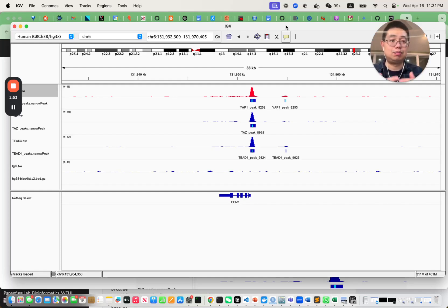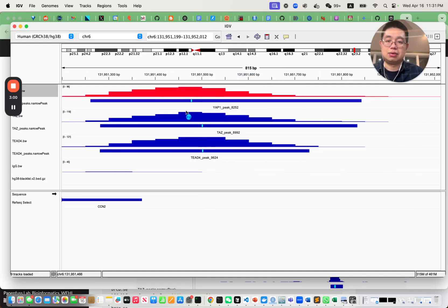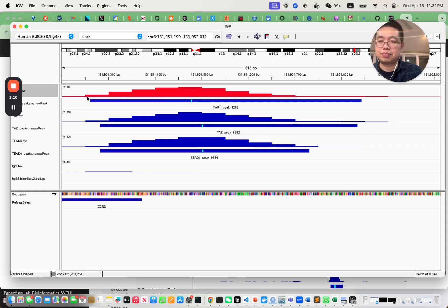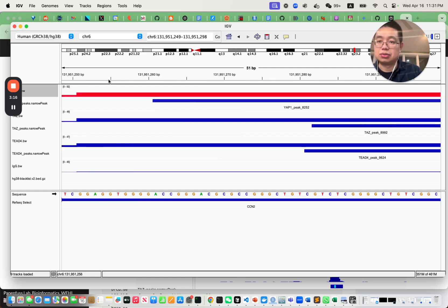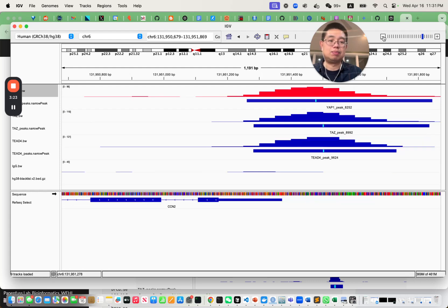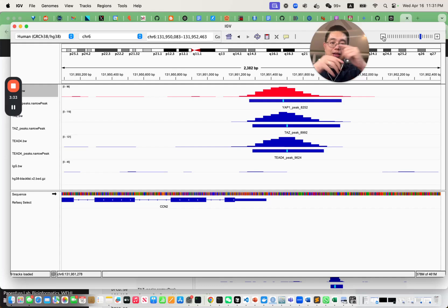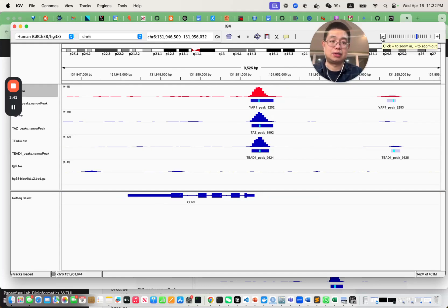Fundamentally, this bigwig file is just a histogram. If you zoom in, you'll see it's just a histogram. It depends on the bin size you use — probably 50 base pairs per bin. The bigwig value is calculated by counting how many reads fall into this 50 base pair bin, getting the average, and that's the value for that bin. It's really not that mysterious once you understand the basics.